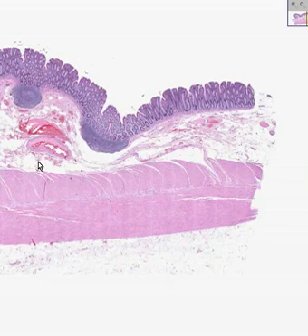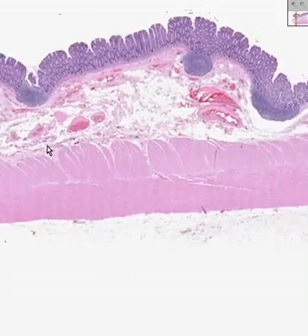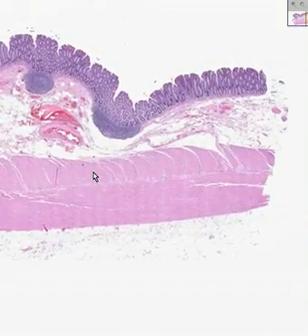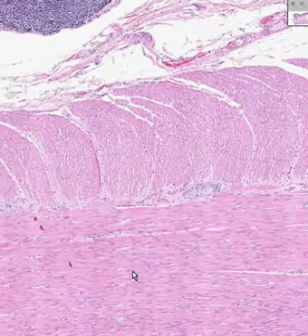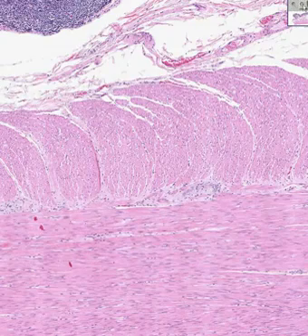Note that this was probably a piece of colon or large bowel which was cut longitudinally with respect to its axis rather than cross-section because the inner circular muscle fibers look like they have round nuclei and the longitudinal look like they're rather spindly. If this was cut on cross-section, it would be the other way around.